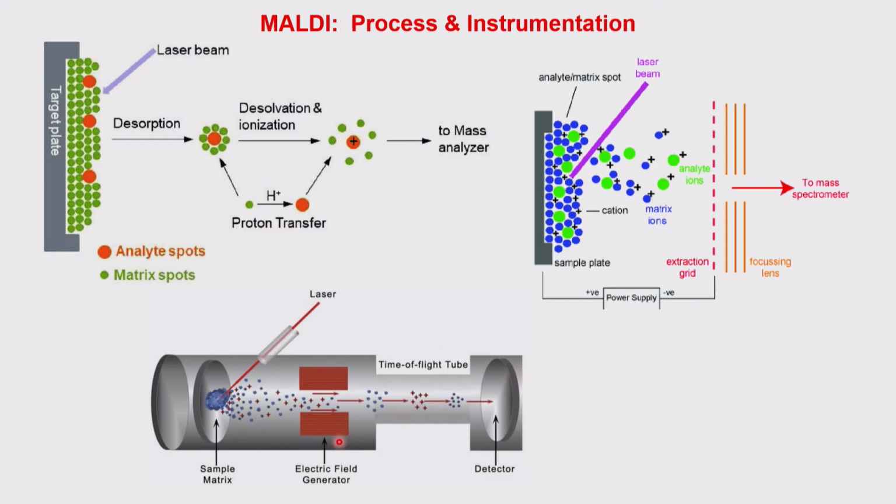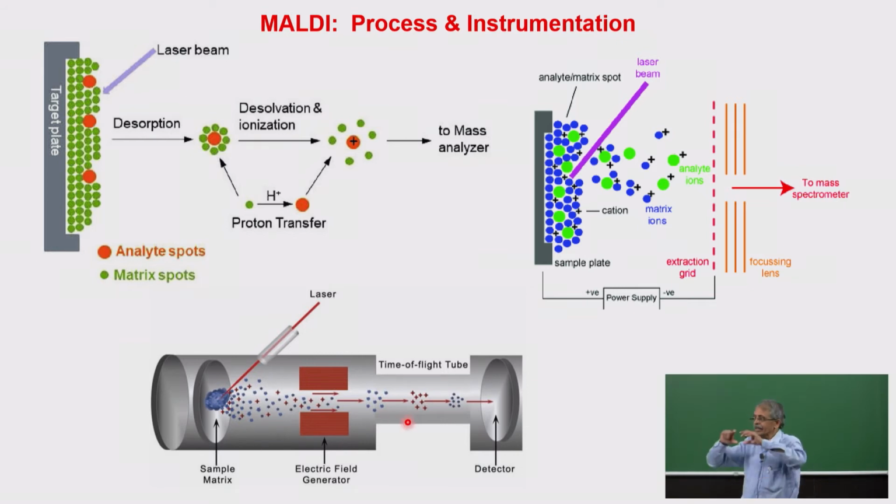This is the detector, and this length will be traveled by those species that you are measuring, because you applied the electric field on this. So you have different levels of the time that they spend in this chamber. That is what is called time of flight. There is nothing other than that. So time taken for each of the species is different. Each species comes differently on the detector, and the detector will give you the current.